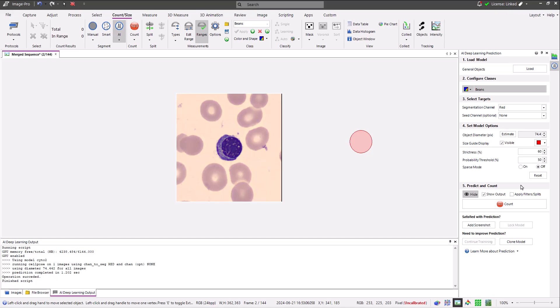Some things to consider before training a new model is that training is usually simplified by cloning and retraining an existing cell pose model as opposed to training a new model from scratch, and also that cell pose is an instance segmentation model and so training must involve teaching your model what each individual instance of your objects of interest look like. In other words, they need to be correctly separated from each other.